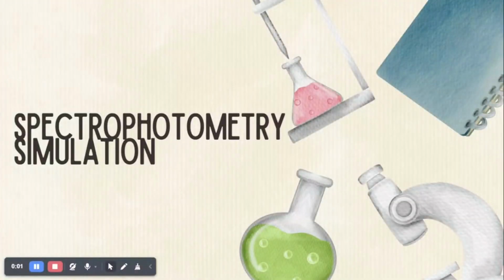Hello, my name is Erica Sanchez, and today we will be performing a spectrophotometry simulation for my AP chemistry class. And you might be wondering to yourself what the purpose of this experiment is.